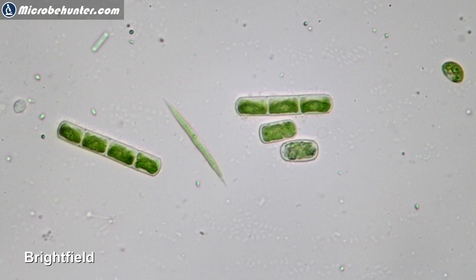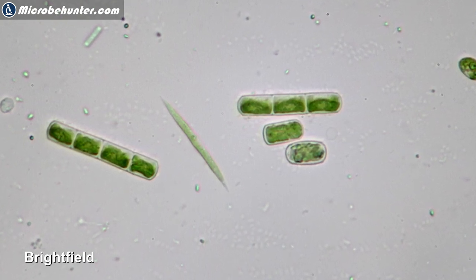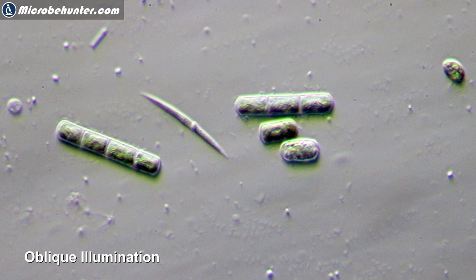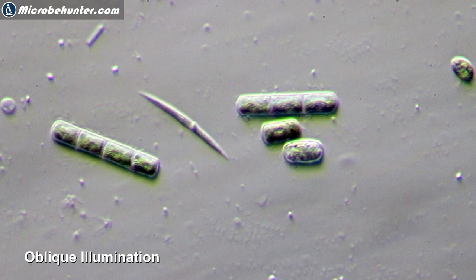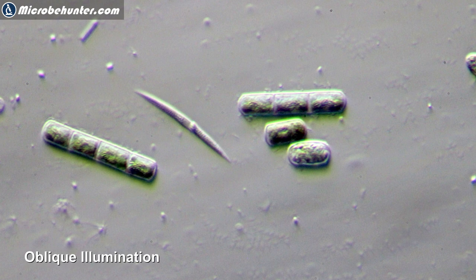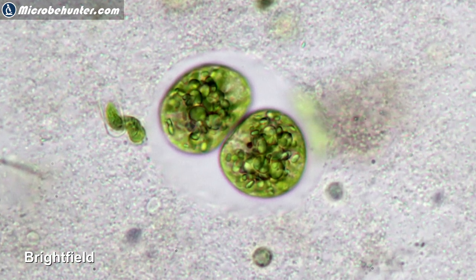The first picture shows a few algae. This one is just regular bright field, just like under any ordinary microscope, and the image looks pretty flat — that's what we expect. But look under oblique illumination: the features really start to stand out and the whole algae starts to look three-dimensional, as if it actually casts a shadow. This gives it a very, very stereoscopic impression.